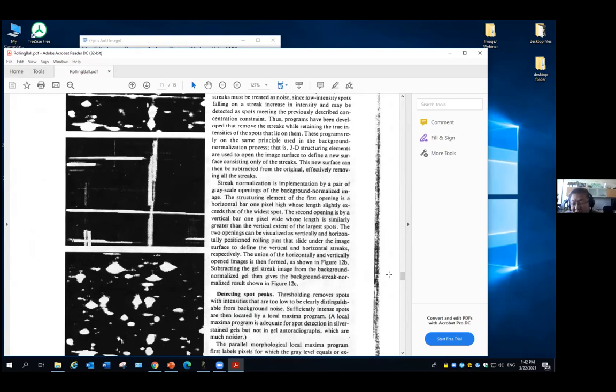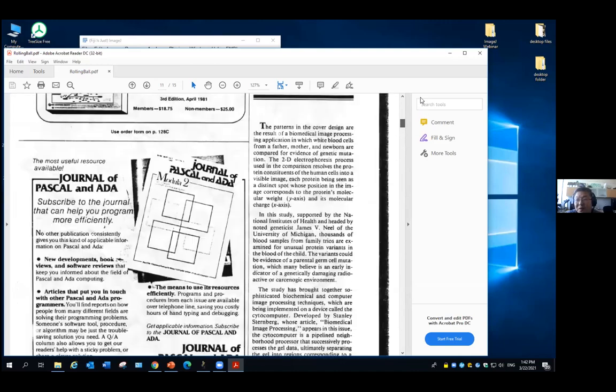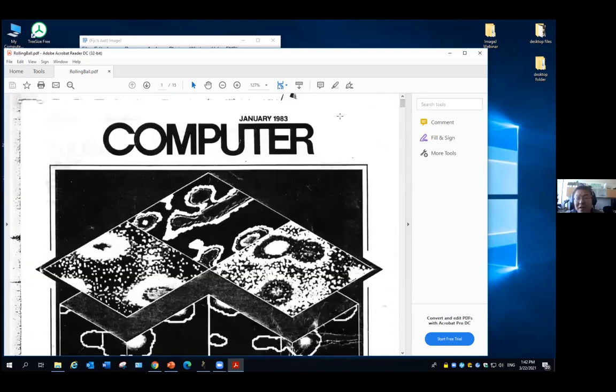And then we just apply it once, using the same parameters on all the images. Then I guarantee my images have the same treatment, so the results are consistent. We can compare the results on different conditions. Another thing is that this computer paper is almost 40 years old, and people are still using it, and that means it is very, very good.